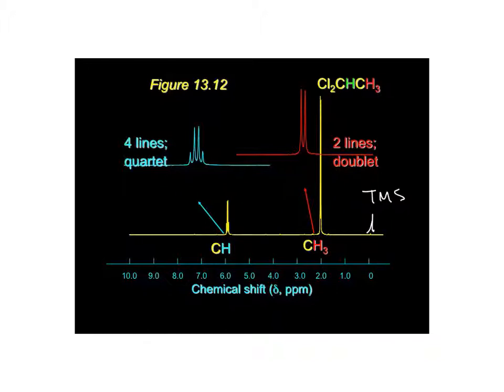Well, less shielding is for both reasons, but how is it less shielded? What's one way that's less shielded? Because of the chlorines. And then the second way, which some people forget, is the fact that it's a hydrogen by itself, whereas like a methyl group versus a methylene, a CH2 group versus a CH group. And so yeah, it's pushed further downfield than the methyl group.